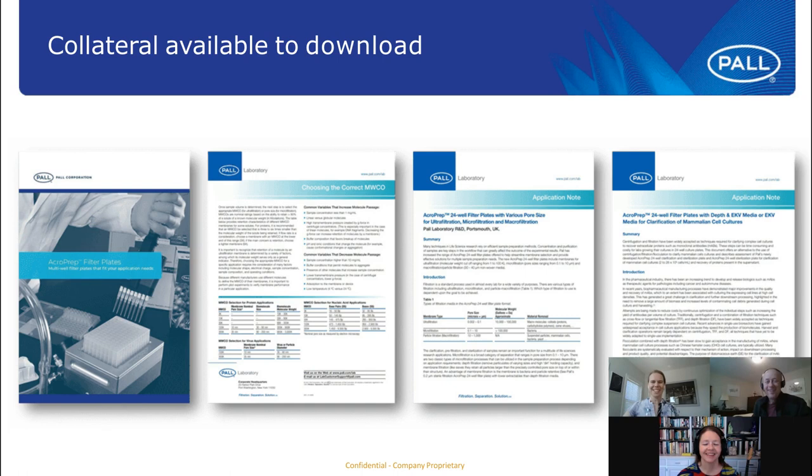Sure. So as far as scale up with the lysate clearance plate, we don't have really application notes from that perspective. But actually for scale up, I think generally what we would look at more is using Supracap depth filters like the Supracap 50, which are available with the whole panoply of different depth filter media, and have the same configuration as used for all our biotech depth filter devices. So those would be more suitable when you are thinking about scale up.